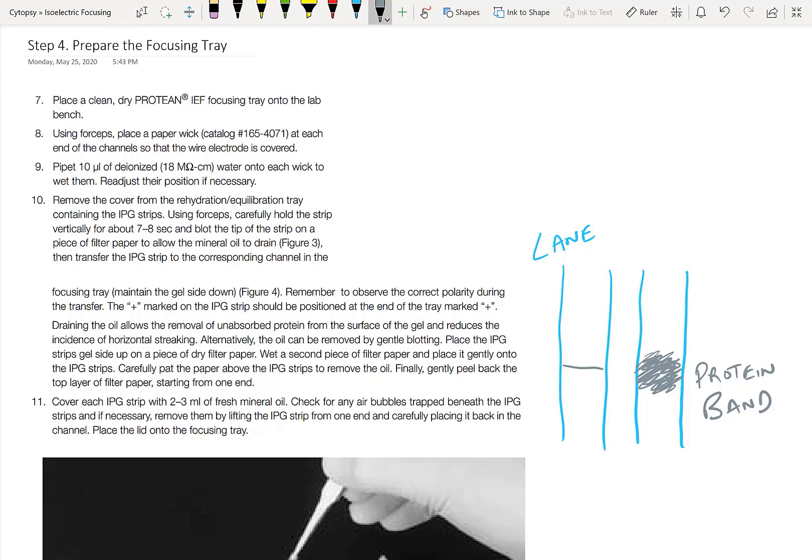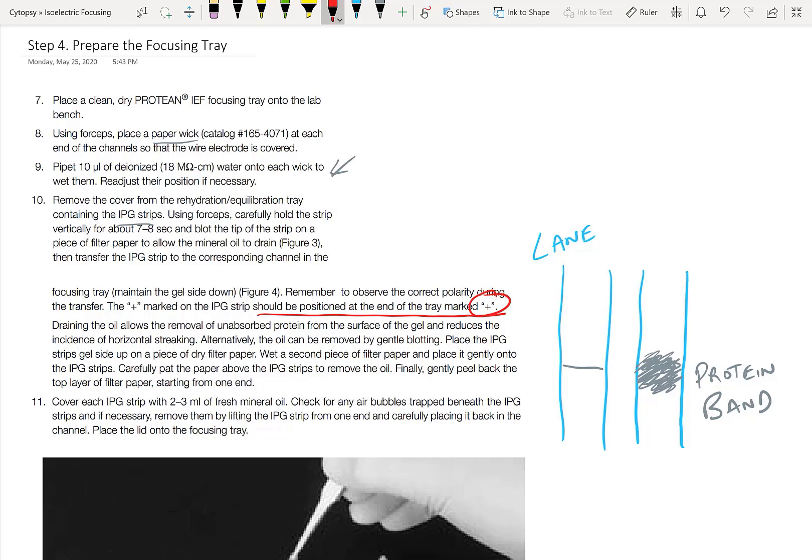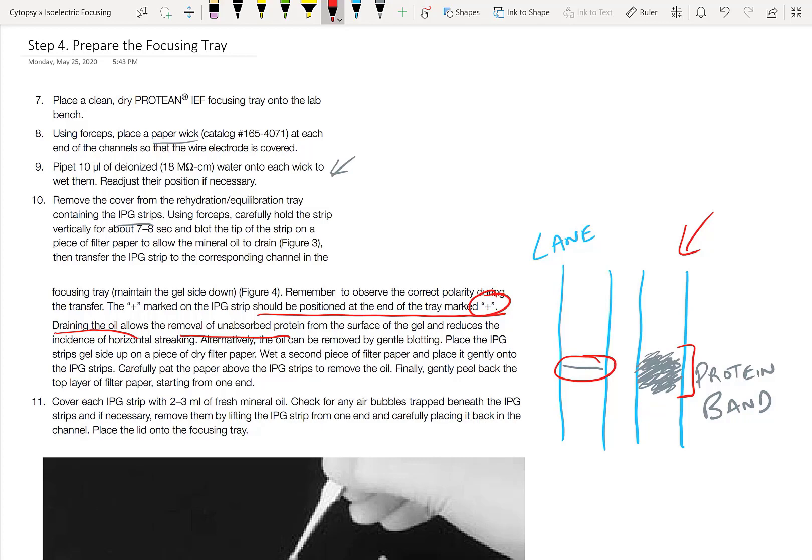In step four, we just have to prepare the focusing tray by moving the IEF gel into the focusing tray. So first, we take the tray and then we add some water to it along with some paper wicks just to make sure that it's properly hydrated and it'll conduct well. Then we move the IPG strip from the equilibration or rehydration tray over to the focusing tray. Once again, make sure that you position it properly so that the plus sign is at the right location. The other thing to keep in mind is that you should drain the oil and get rid of any of the unabsorbed protein because we want to make sure that our gel has all the protein inside and make sure that none of it is outside unabsorbed. This is the end goal: we really want crisp bands when we finally do the analysis of our gel. But if we have unabsorbed protein on the outside, this causes horizontal streaking and our protein bands look hazy.